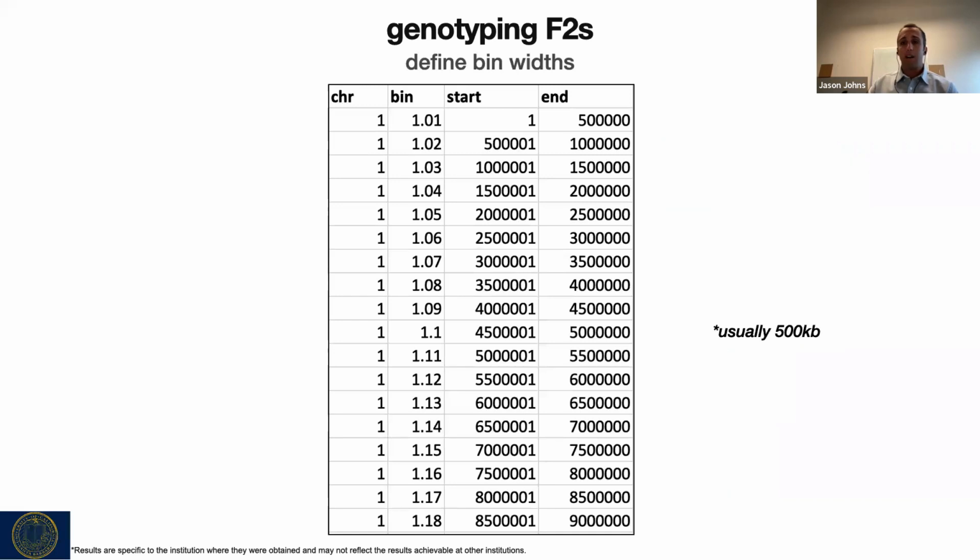This did vary across the genome, and this number again came from previous crosses that had been done in our lab. It depends on the recombination rate, and as I'll show in a bit, there's some funkiness with our physical Aquilegia reference genome. In areas where we had to do any manual rearranging, we would have used smaller bins. Where there's less recombination, i.e. closer to the centromere, we used larger bins up to a megabase.